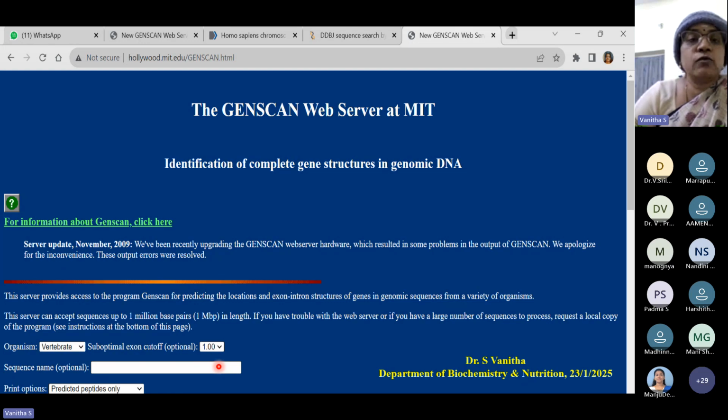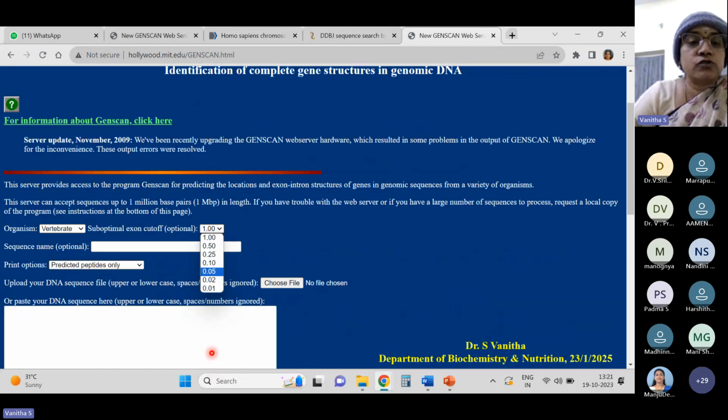Okay. The next one, what you find is, so I have given you here. You can see the scroll down button. You have the list of all the cutoff values. To start with, I'll do it as 0.05. When you're working with this, maybe take one as the lower end, and another as the upper limit, and check out what is happening.